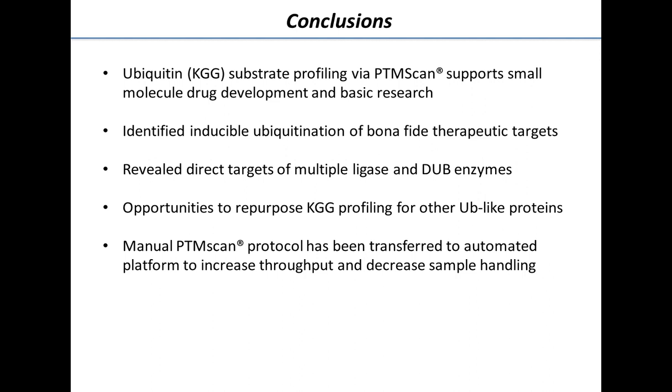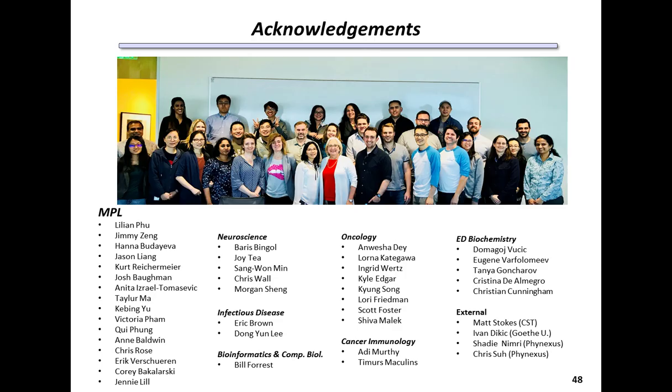We've also discussed the opportunities to repurpose KGG profiling for other ubiquitin-like proteins. And finally, we've shown you how we've transferred the manual PTM Scan protocol to an automated platform, which has allowed us to increase throughput and decrease sample handling.